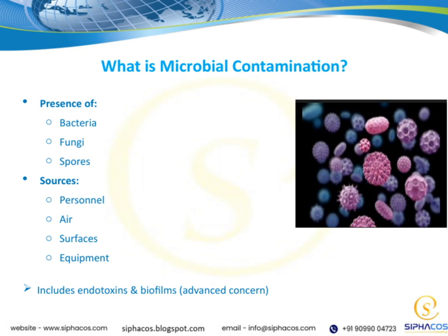Let's talk about what microbial contamination actually is. Essentially, it refers to the presence of microorganisms like bacteria, fungi, and spores in our environment. These tiny entities can be found almost everywhere, on personnel, in the air we breathe, on surfaces, and even on the equipment we use daily.